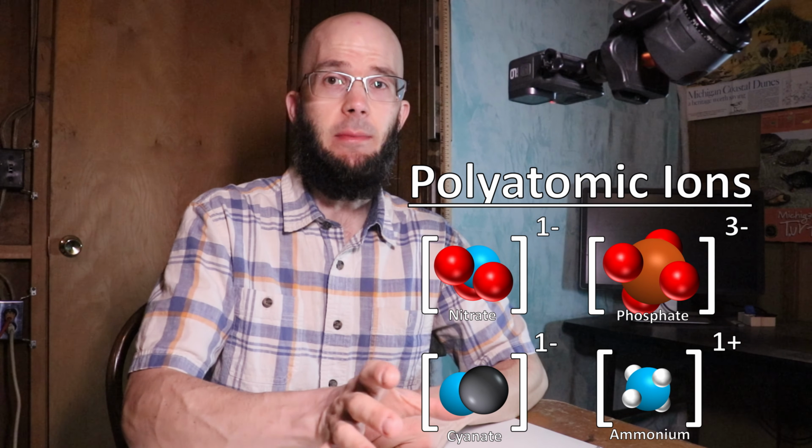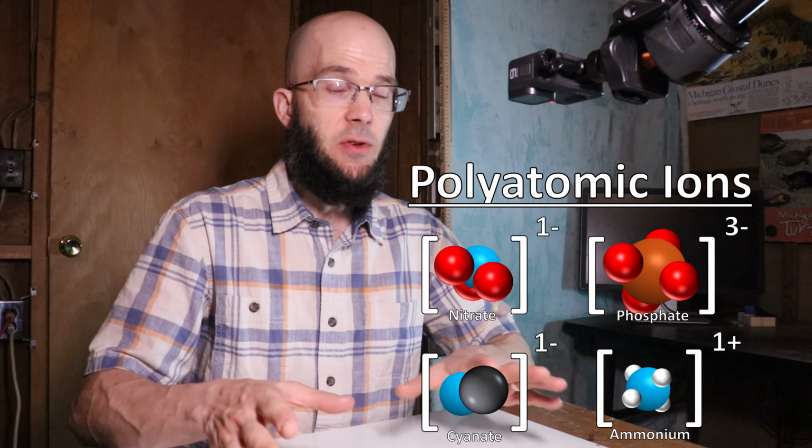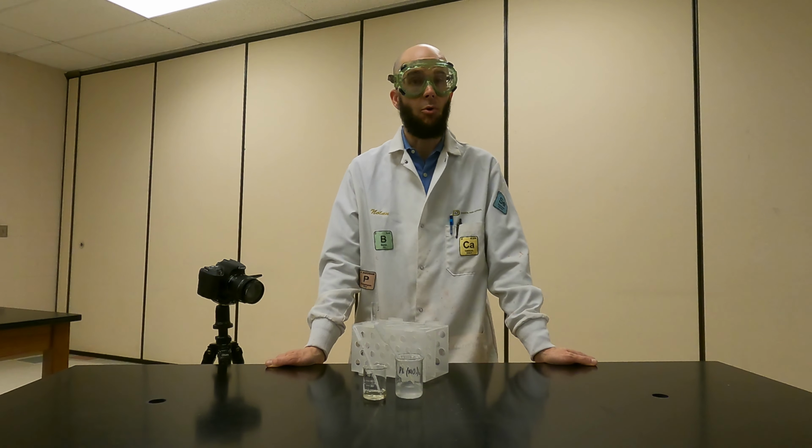And when you're showing polyatomic ions in molecular formulas, quite often you will see parentheses. So if you see a whole bunch of polyatomic ions and a whole bunch of parentheses at the start of a reaction, it might be a double replacement reaction. So let's head over to the lab and do a double replacement reaction. I'm going to demonstrate for you a double replacement reaction.